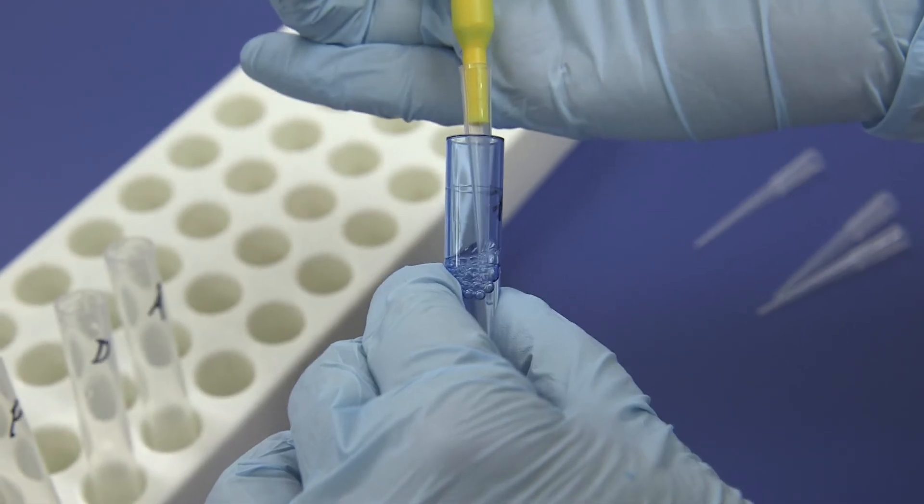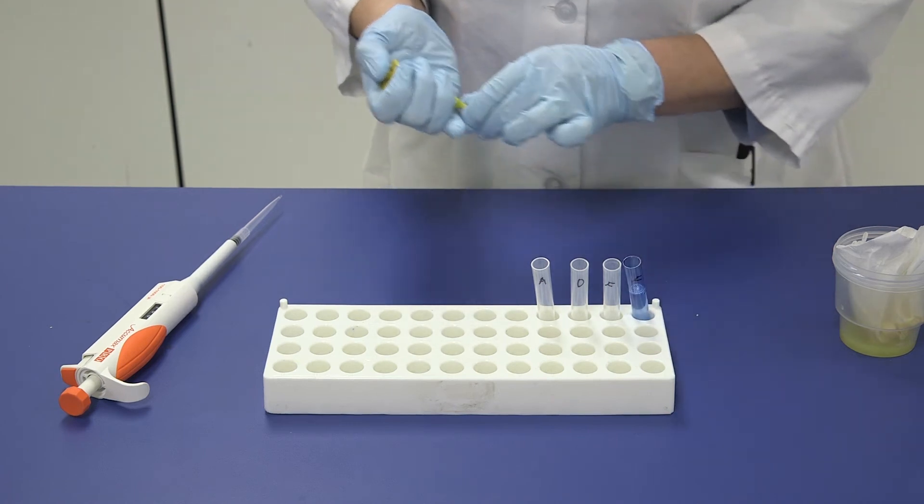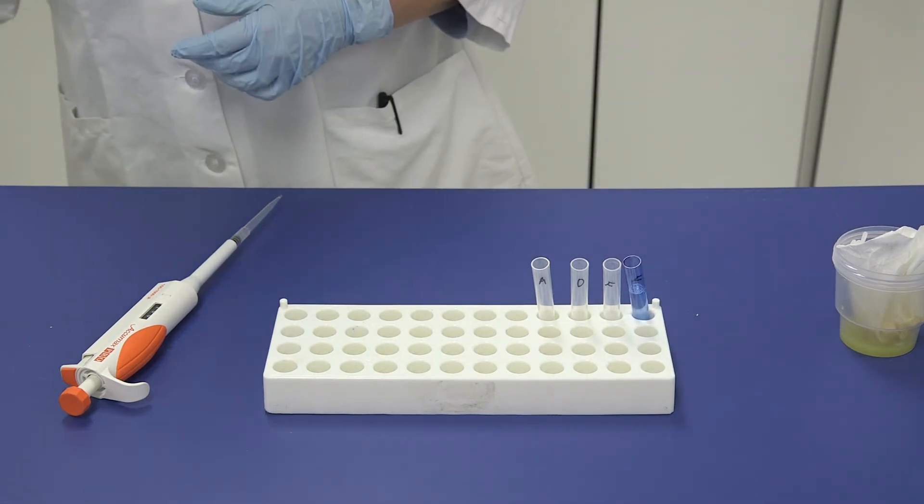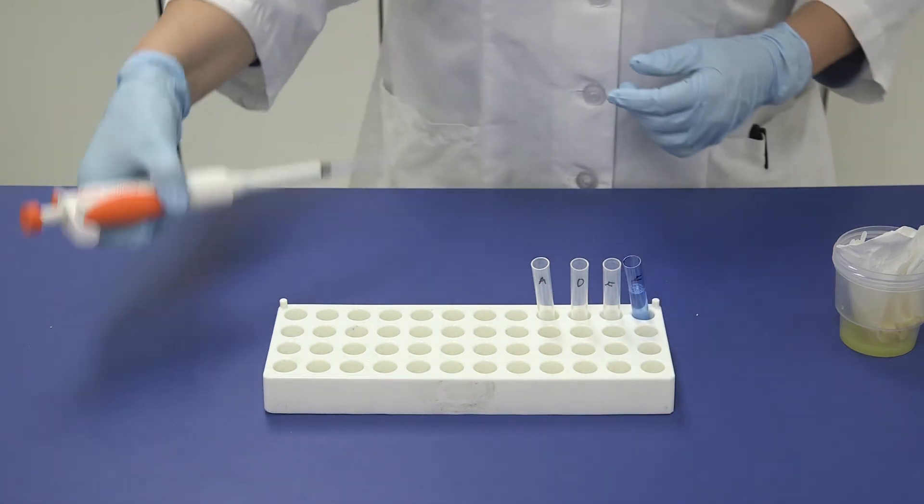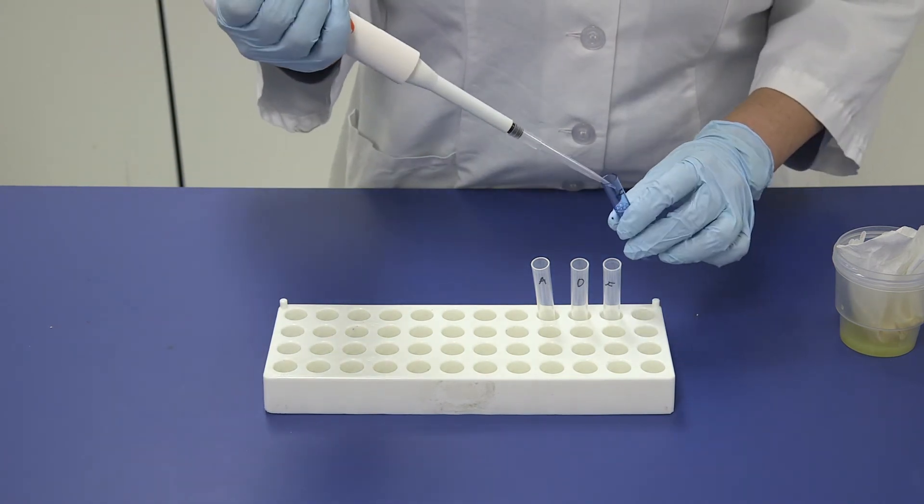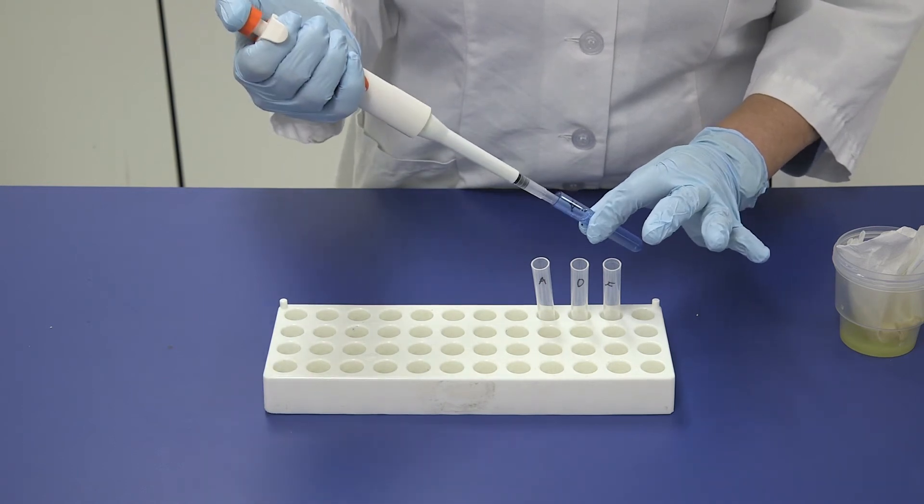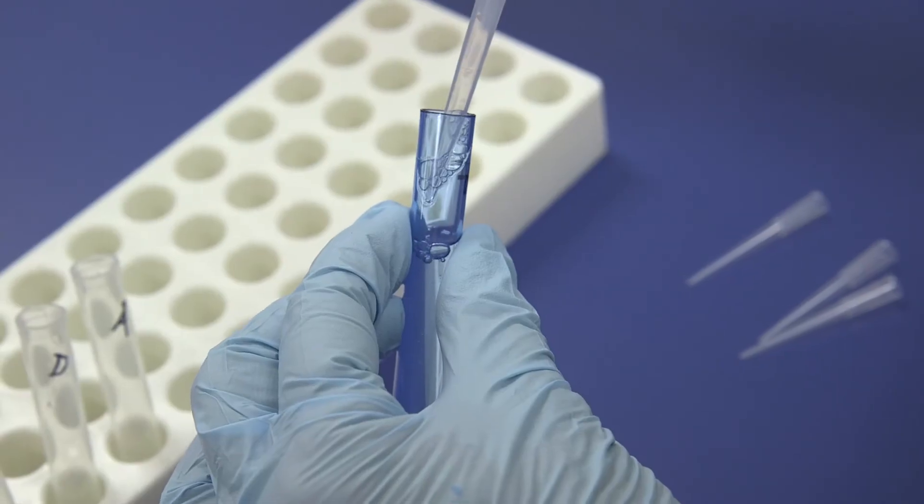Rinse the pipette tip in the DB5 by drawing up and down. Discard the tip and set the 50 microliter pipette aside. Pick up the large pipette with the tip from the prior buffer step and use this to mix the contents in the blue dilution tube labeled F by drawing the mixture up and down two to three times.